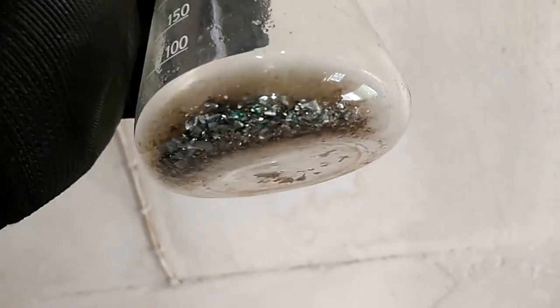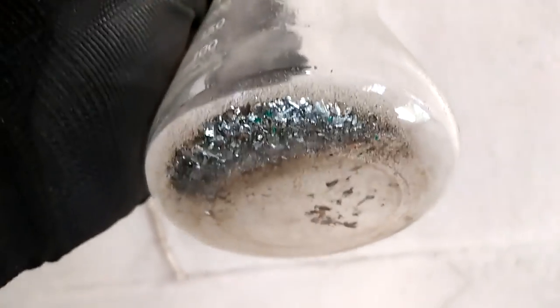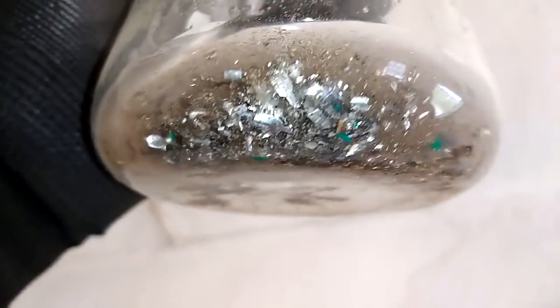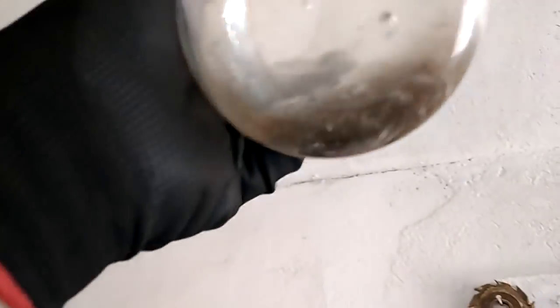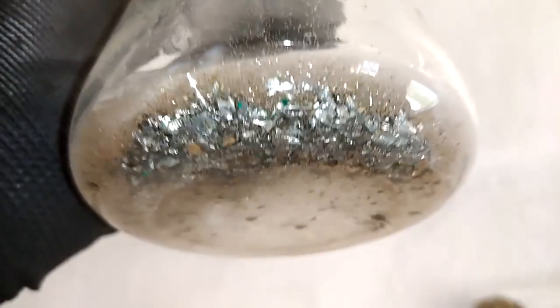Right now in this beaker I collected all the foils. I got a little sponge from the funnel too. So it's not too much, definitely it's not too much there. But it looks pretty clean.